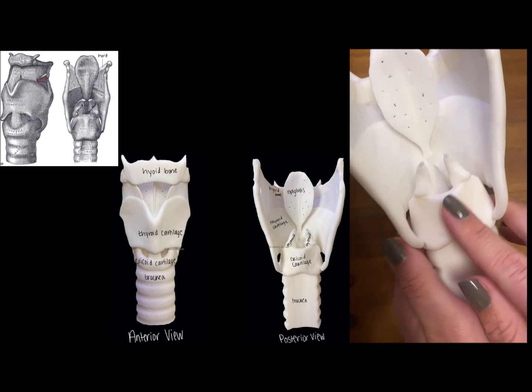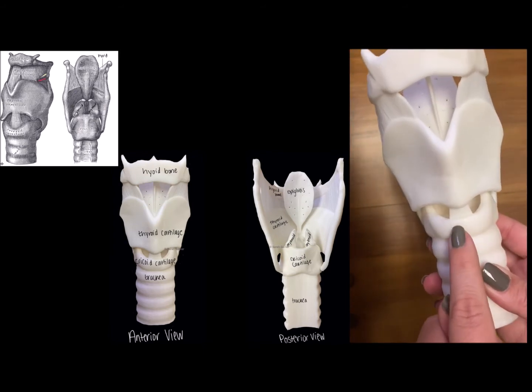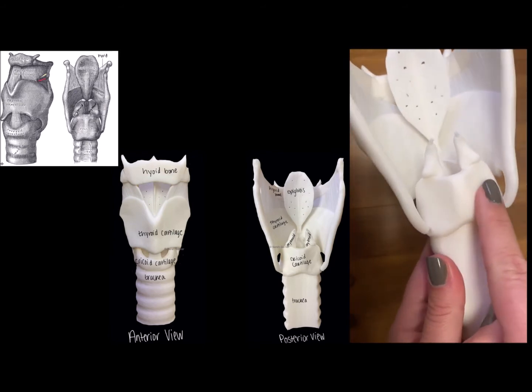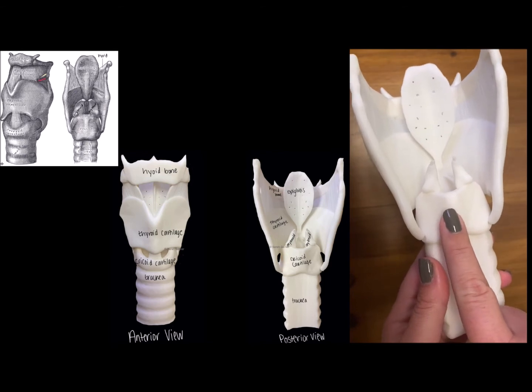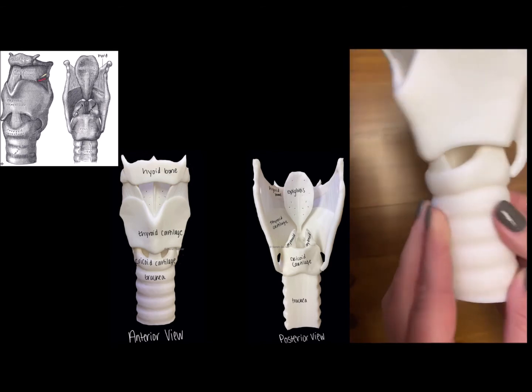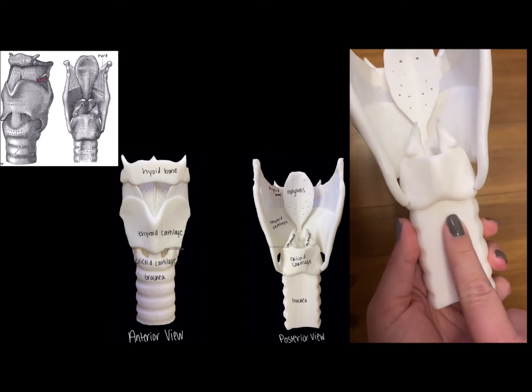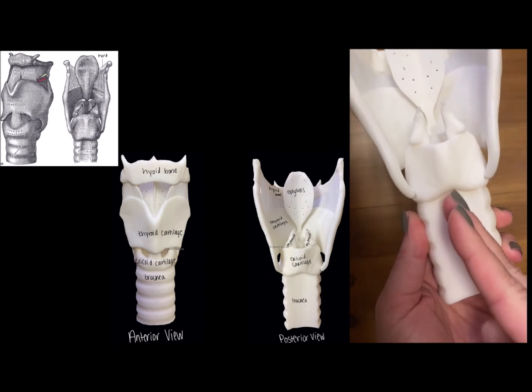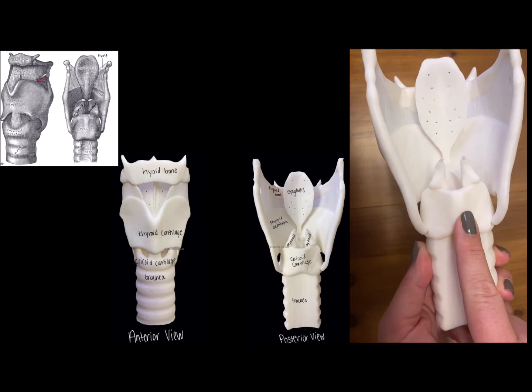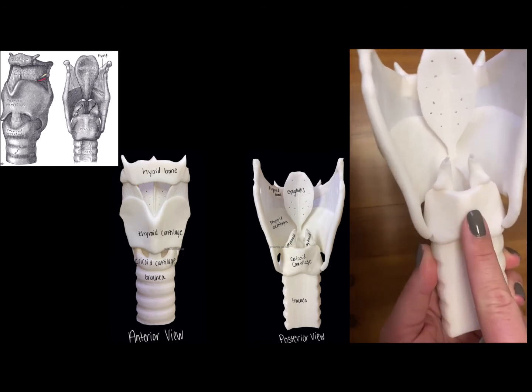And then you can see this cartilage that does go all the way around. So this is that cricoid cartilage, and you can see anteriorly it's not that wide, but then if we flip it over, look how wide it is posteriorly. So this would be cricoid cartilage. And so when you're opening up a larynx specimen, you would open up through the trachea, which is this part here. And remember, at the back of the trachea, it doesn't go all the way around. It's connected by that trachealis muscle, so this is easy to cut. Then you get to the cricoid cartilage. It can be kind of tough to cut, and that's because it's the only one that goes all the way around. So thyroid cartilage, cricoid cartilage.